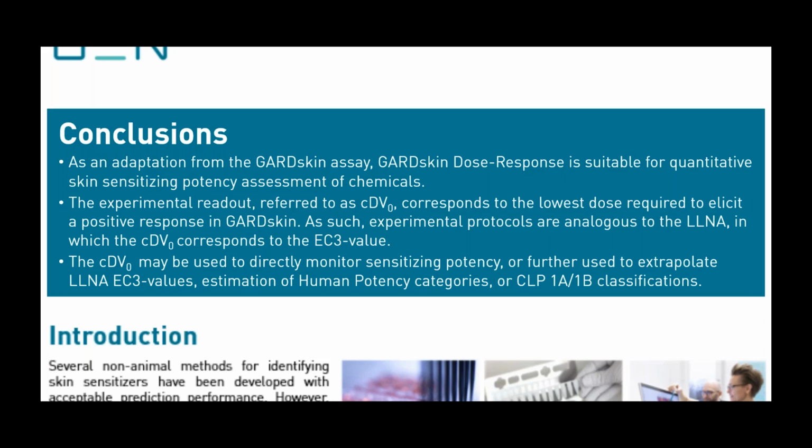These experimental protocols are analogous to the local lymph node assay, in which the CDV0 concentration corresponds to the EC3 values. The GARD skin dose response CDV0s may be used directly to monitor the sensitizing potency of a compound, or they can further be used in order to extrapolate local lymph node assay EC3 values, or for estimation of human potency categories, or also for direct assignment into different CLP categories as strong and weak sensitizers.